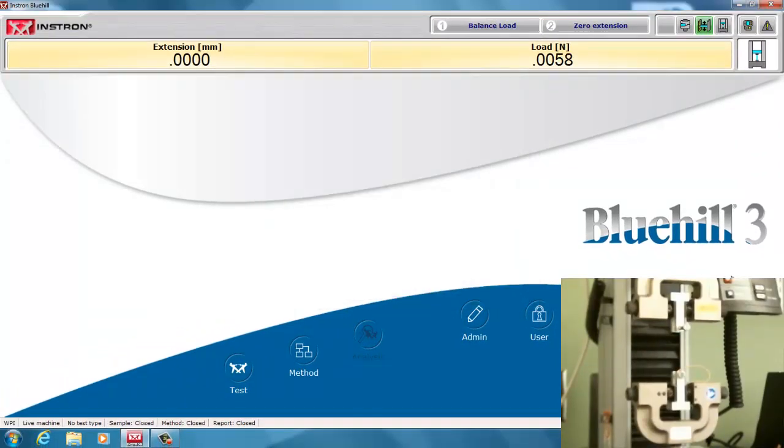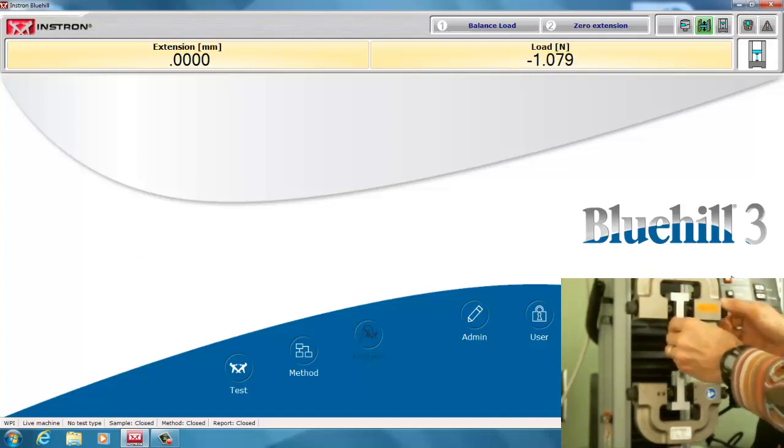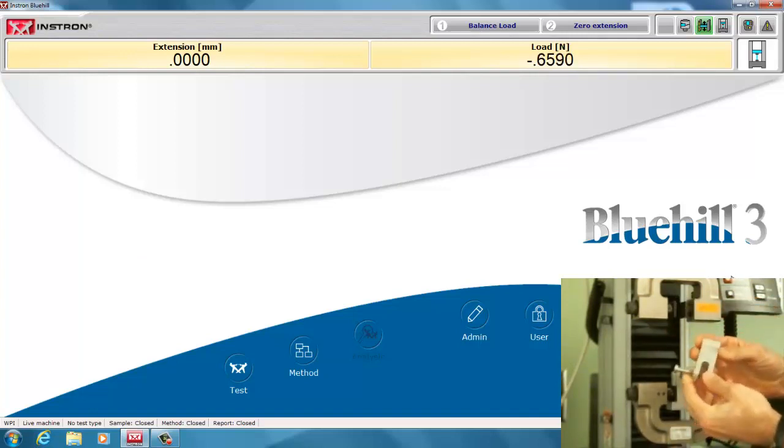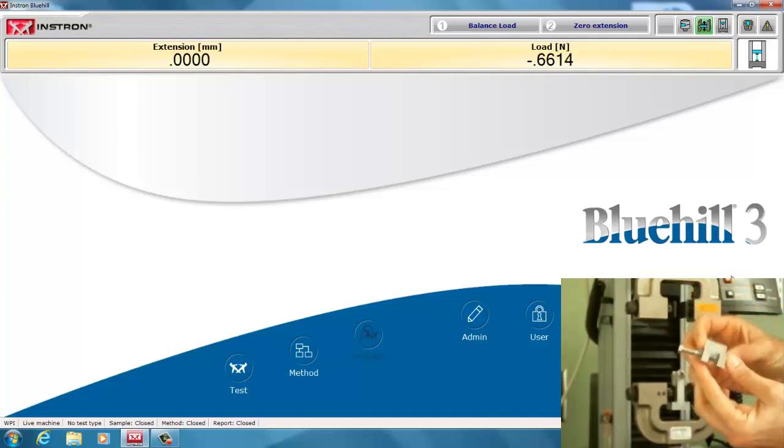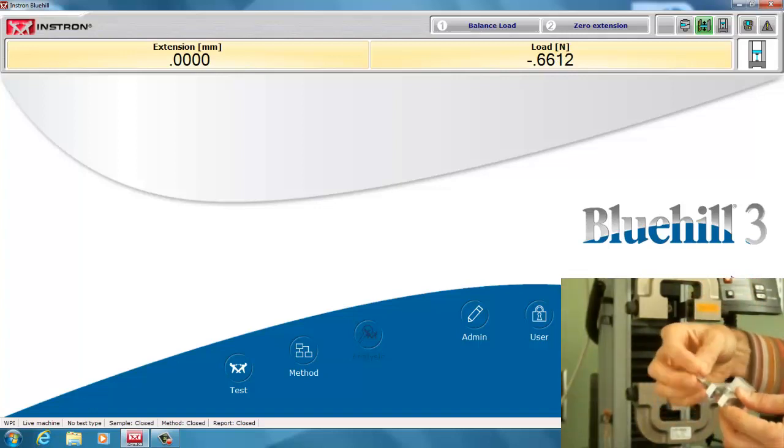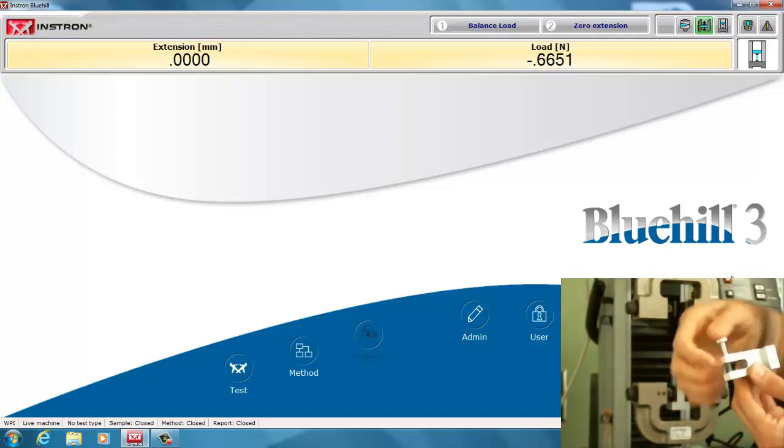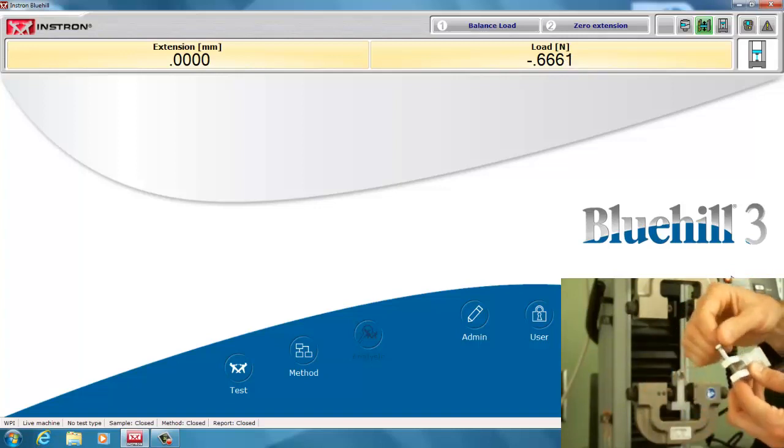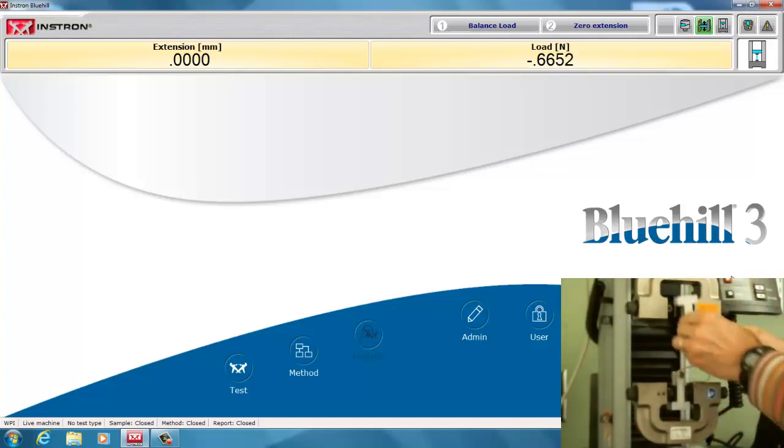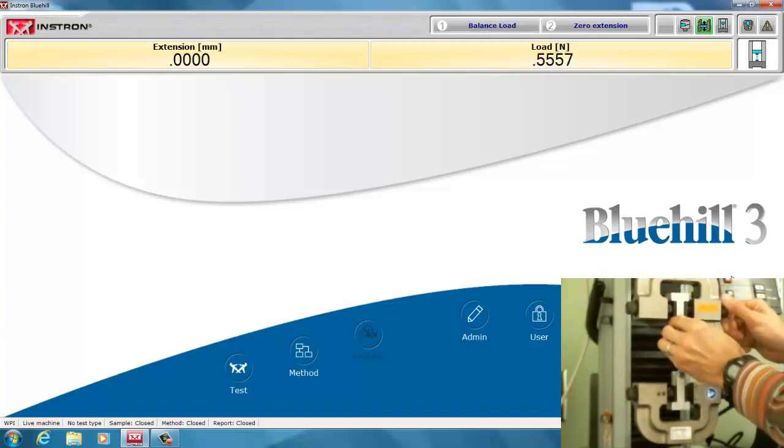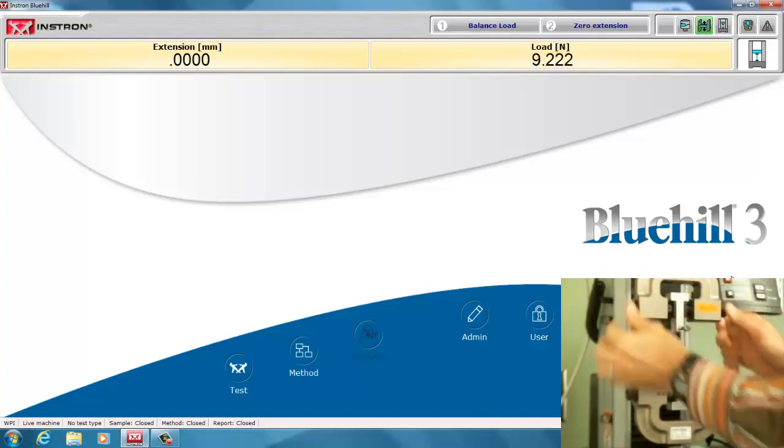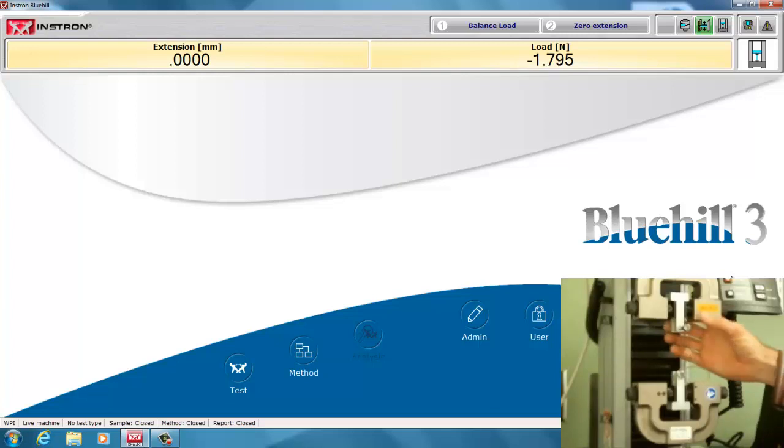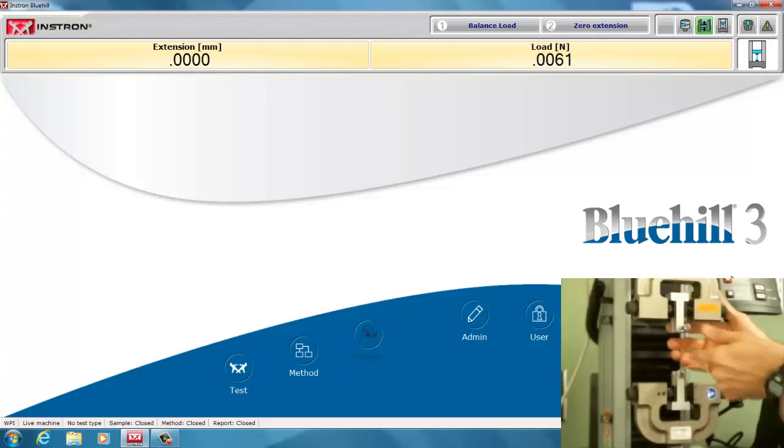These are specialized grips. These are custom made ones for relatively large blood vessels or grafts. It's a very simple device where we just put a pin in there, and we pull the material. It has a T shape here, so that when it's in the grips, we don't even have to tighten them very much, even by hand, because the T here on the grips will hold it in tension.